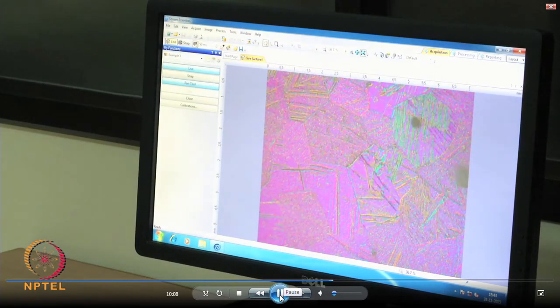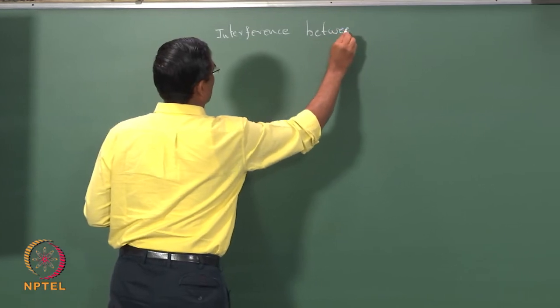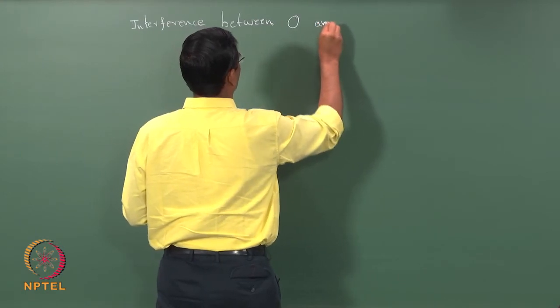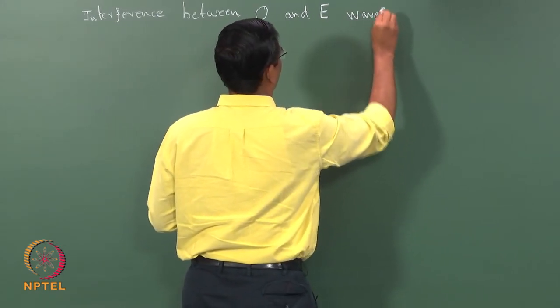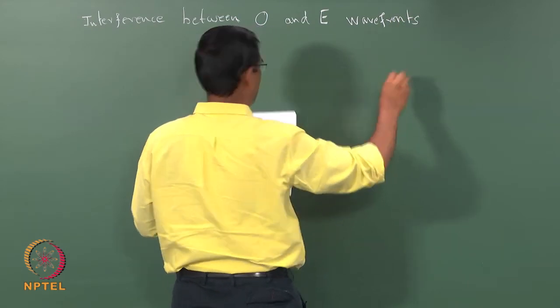Now I will go to the blackboard and draw some schematic of ordinary and extraordinary wavefronts in the image plane.